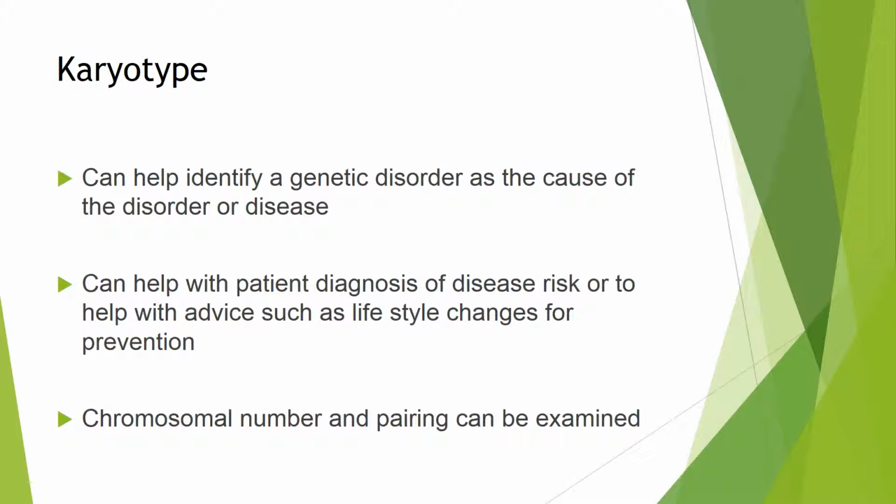Again, chromosomal number, banding, size, and shape can also be seen in the karyotype. So karyotypes are very useful in medicine and for patient prevention.